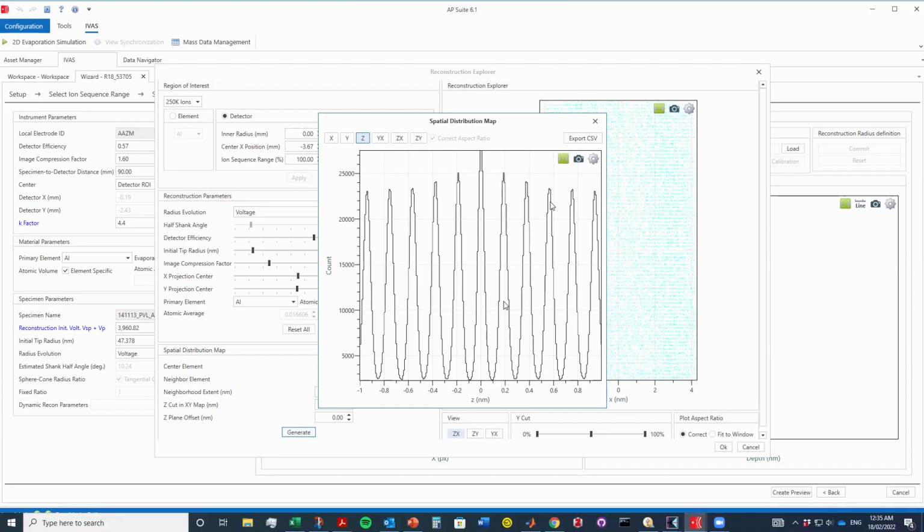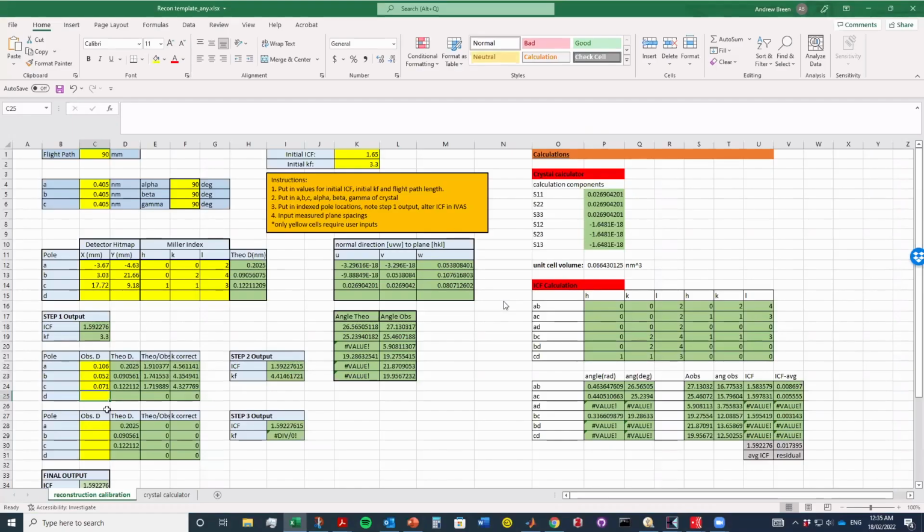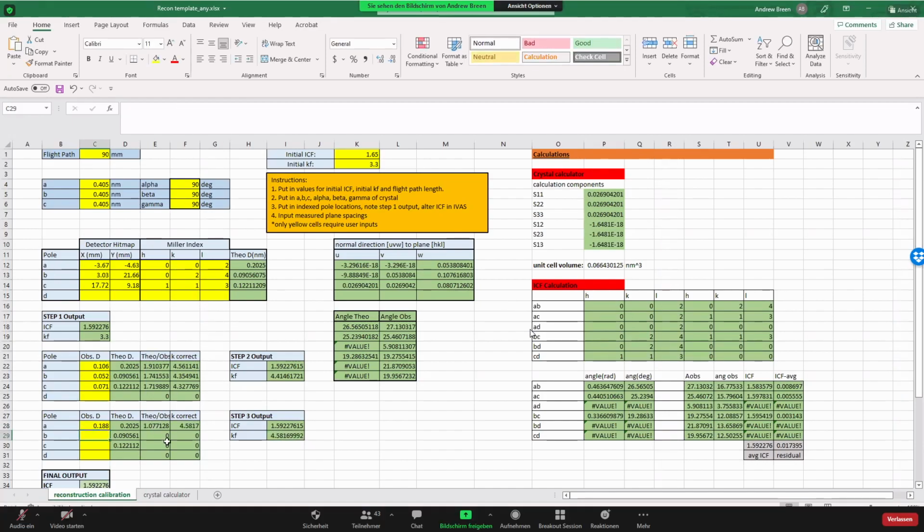You can see already that the plane spacing is much larger now. So that's good. So 1, 2, 3, 4, 5. Let's just go out to about the 5th one. I'll take the highest point here, 0.94 divided by 5. Okay, so that's looking good, right?